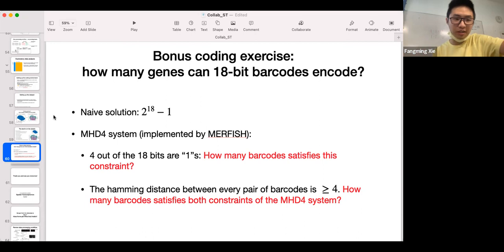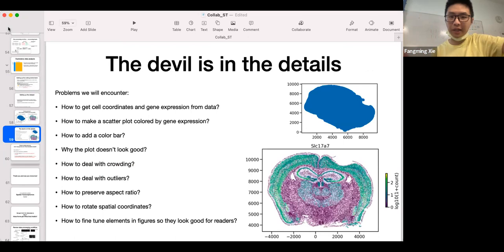But now I think the last business of today's workshop is to go back to this. How do we go from there to here, the above to the bottom? And let's do that. For that, I'll create a notebook myself. First, I'll give you a few minutes while I'm setting it up to try it.